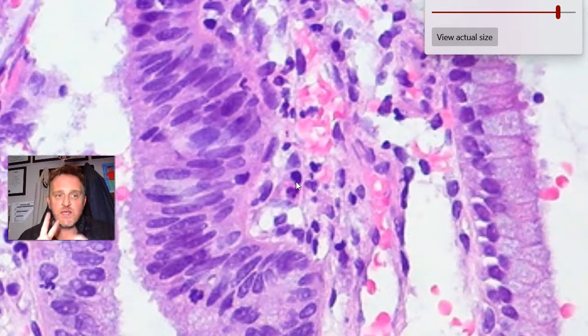Now, the second component to the stain, and you guys will do this in the practical, is the eosin. If it's a standardized and a good stain, it should stain up three shades. And I am seeing three shades, so I get an orangey red, and then there's this purpley pink shading, and possibly a lack of a third kind of shading.